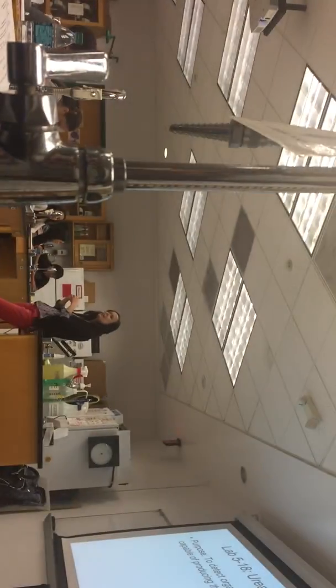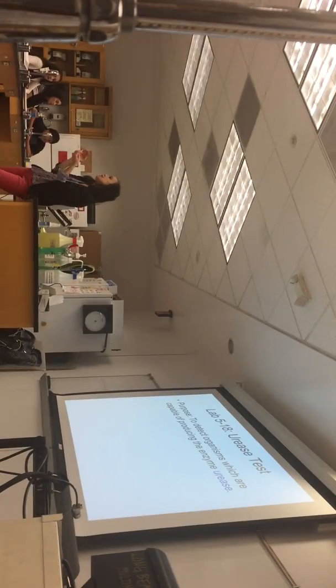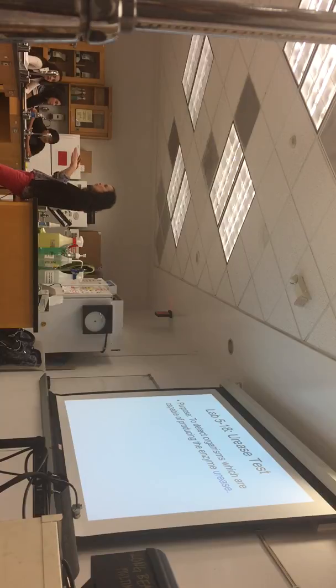Out, especially if you're in that Enterobacteriaceae family. But aside from IMViC, the accessory tests like phenylalanine deaminase, DNase, and urease help you to narrow down even more. So IMViC is a good starting point, and then the coliform tests are also really helpful for narrowing down.